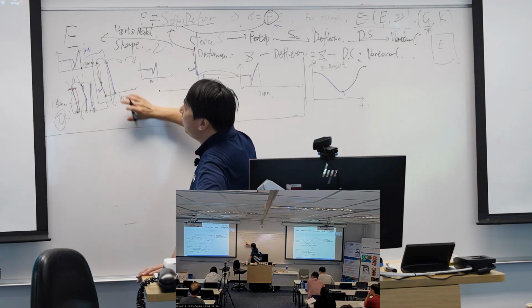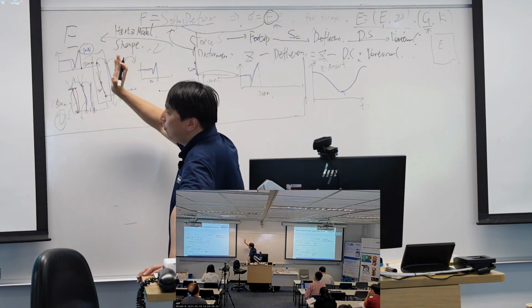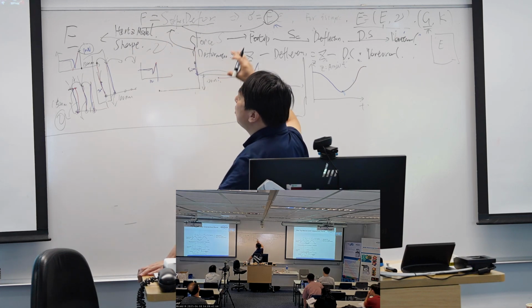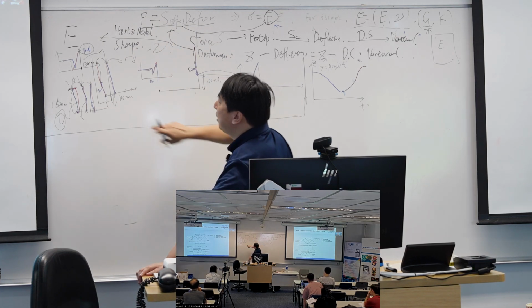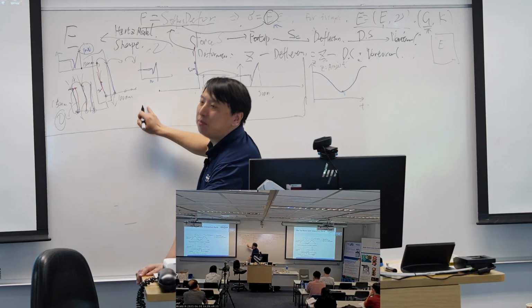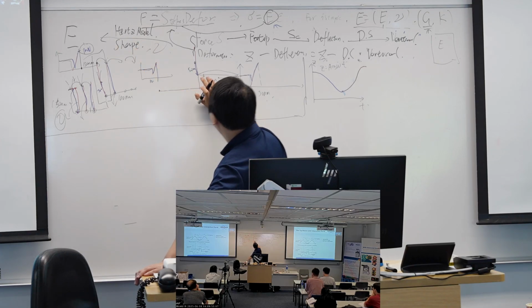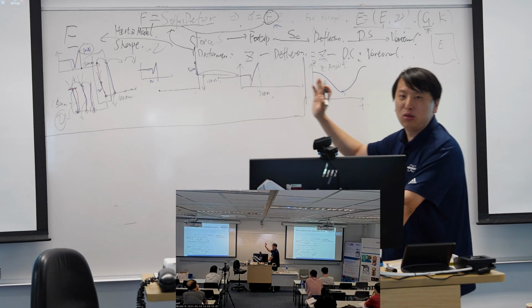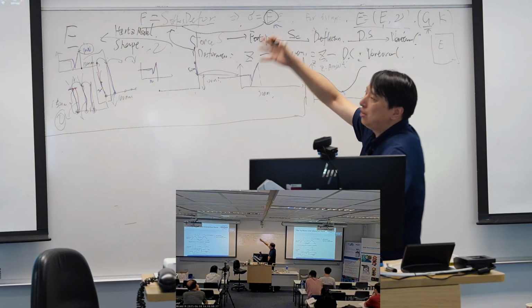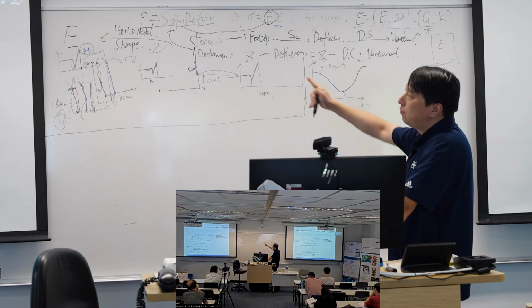So the idea is we define a maximum force and we define a retract distance. Using this idea, we can do a force curve mapping, and we show this kind of example. Since the force curve only defines the retract distance, we do not define the extend distance. As such, we can capture this kind of images using the force curve.